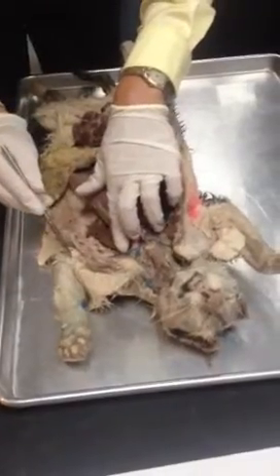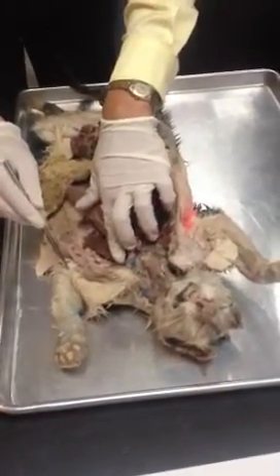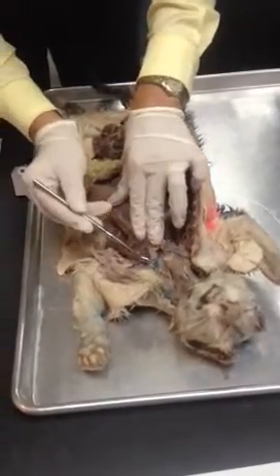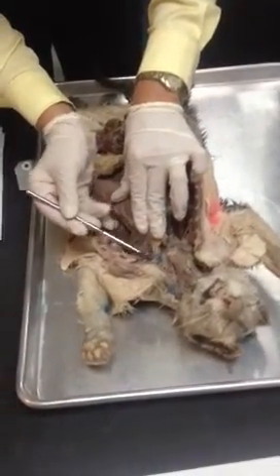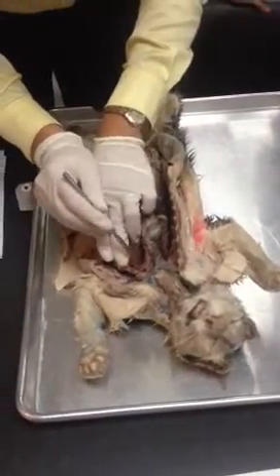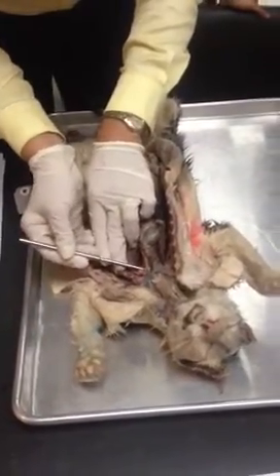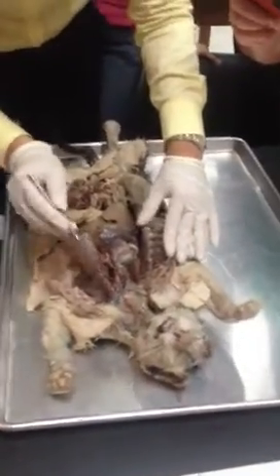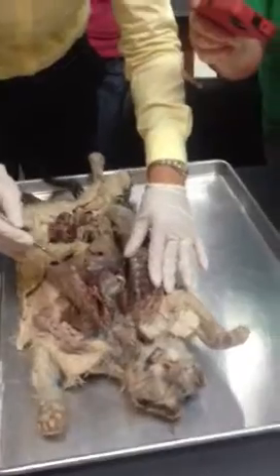Into the brachial, and we did not go any further, right? That way, that would be it. This artery would be brachial, this one would be axillary, and here, this one would be left subclavian, right? Left subclavian. I guess that would be arteries in a thorax.